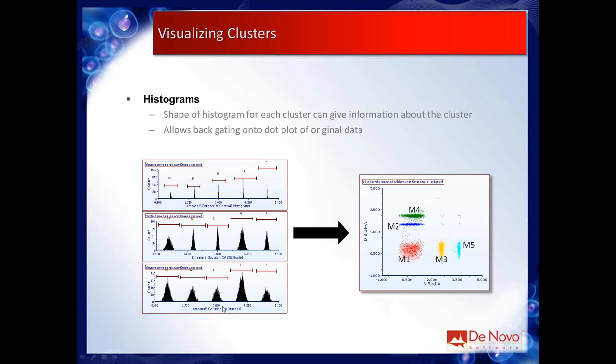And then this one down here, the spread of these histograms is not scaled, but it is scaled by the number of events. So the height of the histogram of each peak is going to be proportional to the number of events within the cluster.